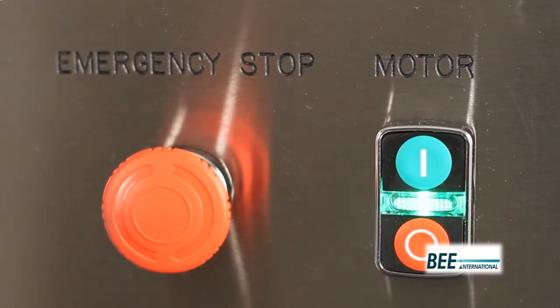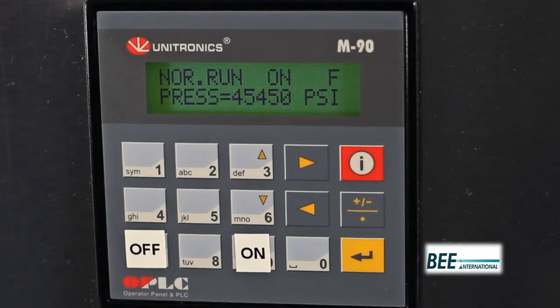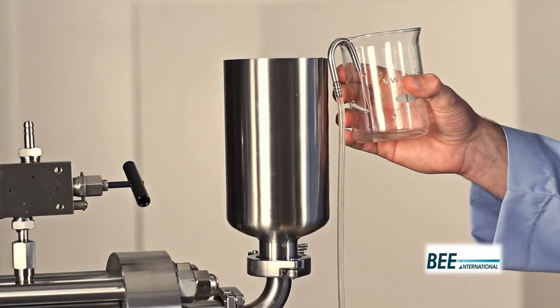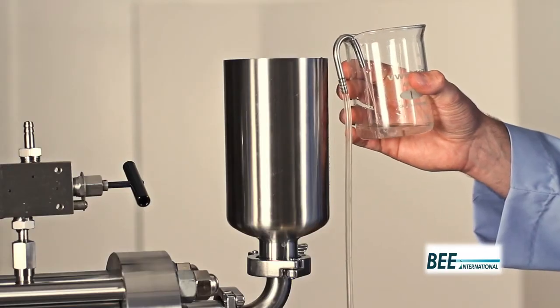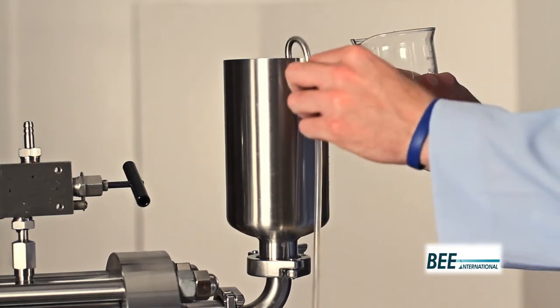Turn on the intensifier pump by pressing the on button on the PLC display. Process pressure is displayed on the PLC. Turn the pressure set dial to adjust the process pressure anywhere up to 3,100 bar or 45,000 psi. Your product is now being processed. You may collect or recirculate your product.